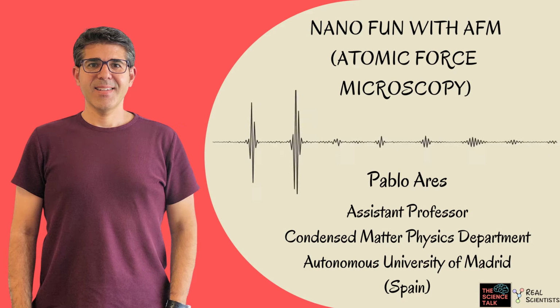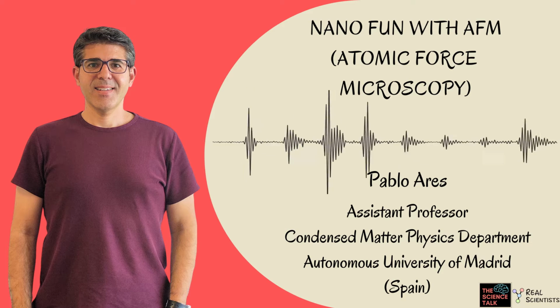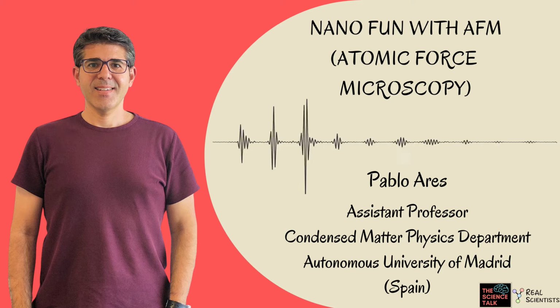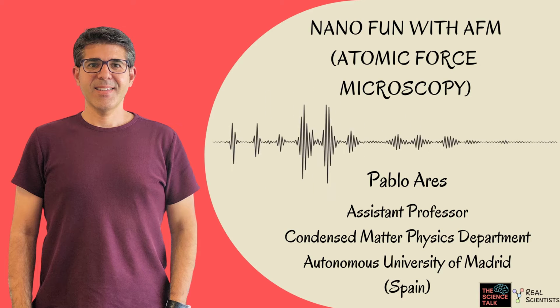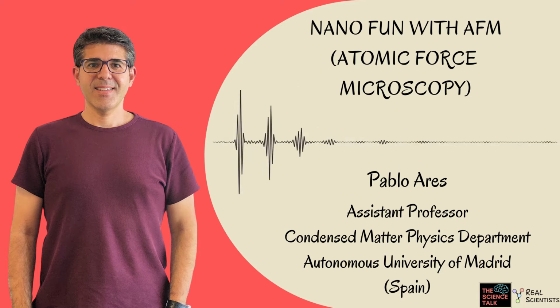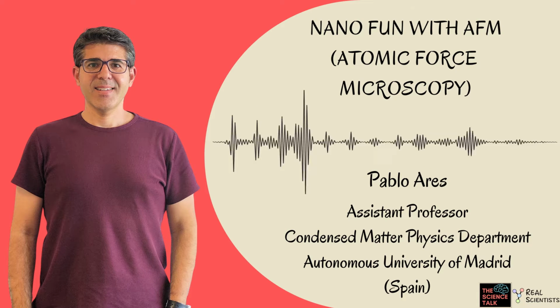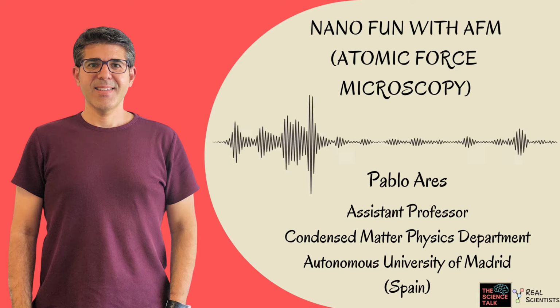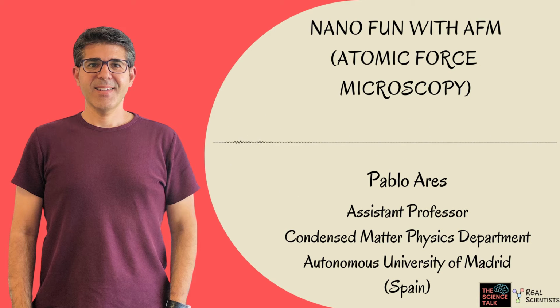So let's start with understanding your research a bit. Could you explain your research to us in super simple words, please? I've been working my whole career with atomic force microscopes. My research basically deals with the AFM, atomic force microscope, usually called AFM from the capital letters.